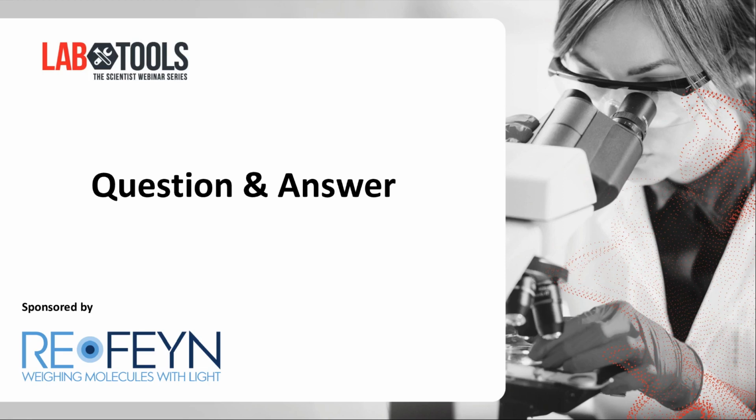Yes, thank you. What are the lower mass detection limit and mass resolution for diffusing molecules on the SLB? Yeah, so in principle, it's very similar to conventional mass photometry. So maybe slightly worse. It depends really on the imaging conditions and also on the size of the molecules that you're working with.